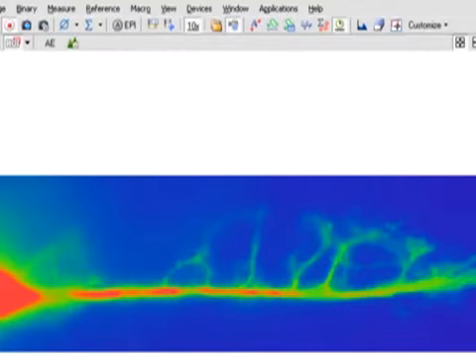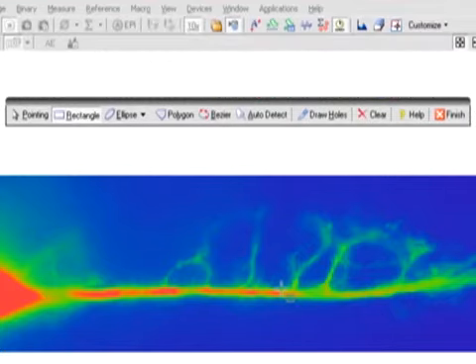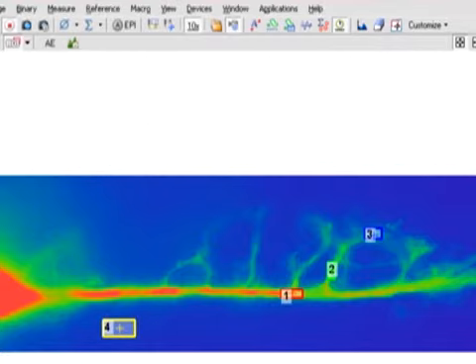In the imaging software, select Regions of Interest, or ROIs. These regions define where the software will take intensity measurements. We generally image primary, secondary, and tertiary branches of the presynaptic neuron. Place an additional ROI next to the dye-filled neuron to obtain a background value that is later subtracted from all other data points.